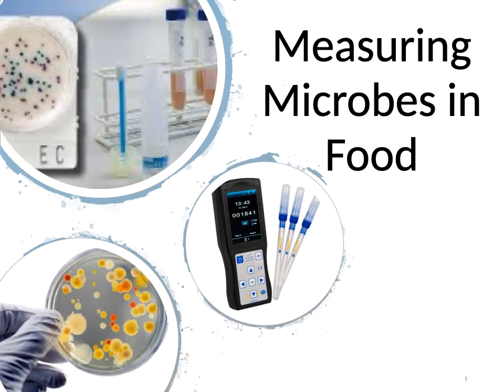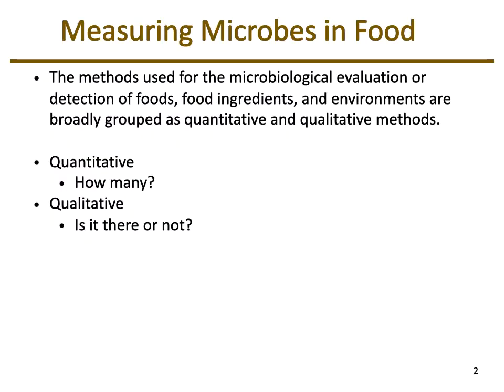Okay, in this audio lecture, we're going to be looking at measuring microbes in the food. So what different methods can be utilized in order to detect or evaluate if foods, food ingredients, and environments have microbes present in them? So again, I'm looking at these methods. They are used to evaluate and detect microbes in food or food ingredients or the environments in which foods are being processed or maintained in.